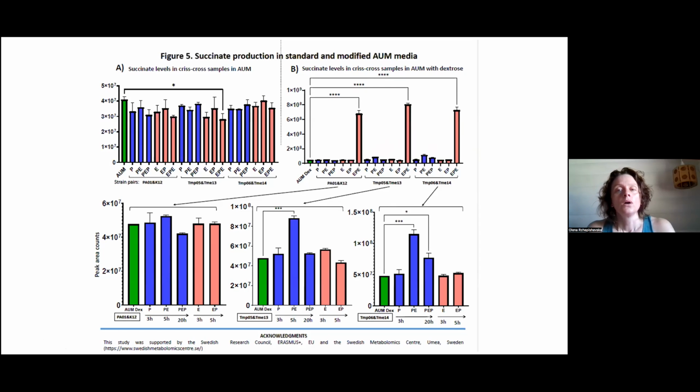So his conclusion from this experiment is that E. coli is producing a lot of succinic acid. But how would we know if Pseudomonas in this situation is making any use of succinic acid? So here down the next panel, it's a zoom picture of this picture. Panel, which one? B, right.